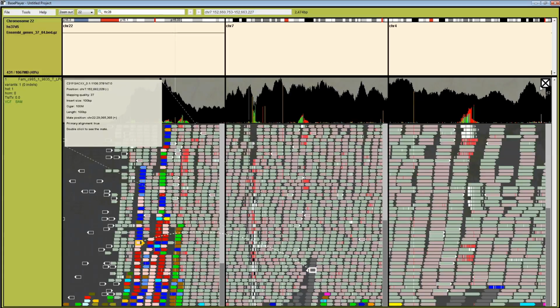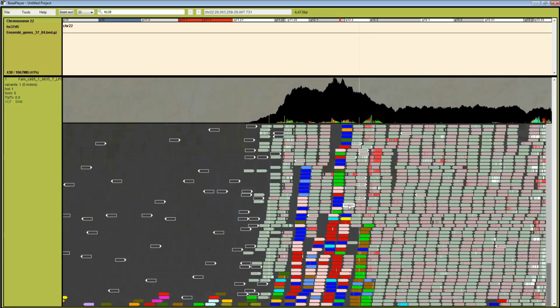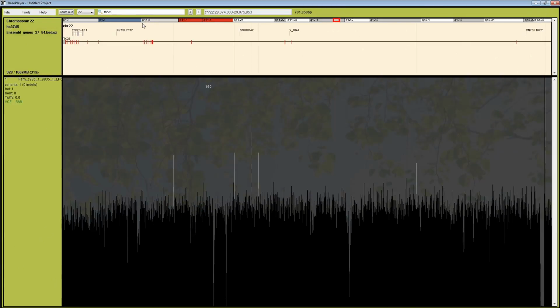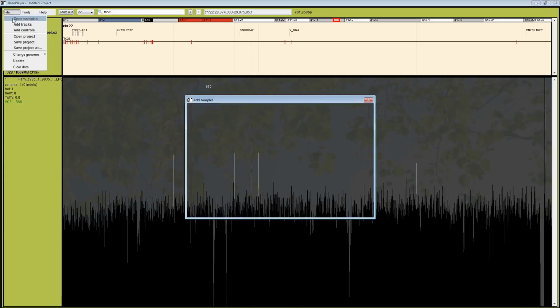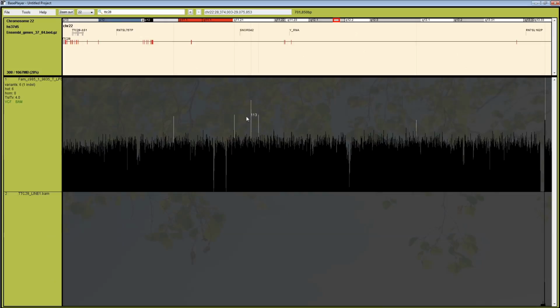But I'm going to go ahead and just close these now because you get the idea, and as you can see, there is quite a mess at the flank of this line1 element. So let's go and now open Nanopore's third generation sequencing data. So we'll just open this.